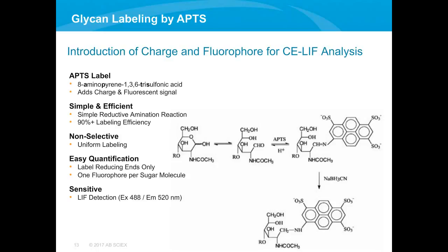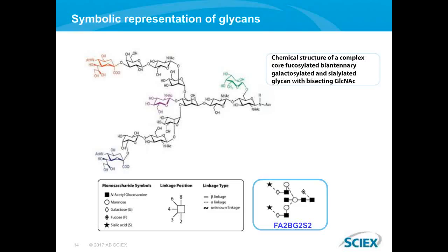Again, the reaction can be done very rapidly with optimized parameters, but this R group is what actually represents the sugar structures. And of course, we have to somehow represent these sugar structures in the rest of this talk. Since these would be the structures themselves, I don't think everybody would like to see those structures filling up these slides. So we should use some kind of a simplified methodology to show these sugar structures.